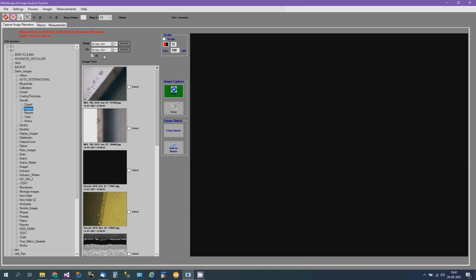In this video, we will be covering the 2D measurements module. This is for basic 2D measurements like length, distance between, area, angle, radius, diameter, perimeter, etc., or distance between any two objects. So basic 2D measurements can be done through the 2D measurements module. We are going to cover how we are going to do the measurements.